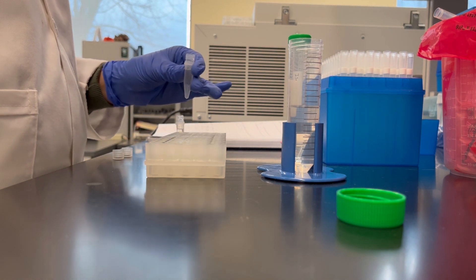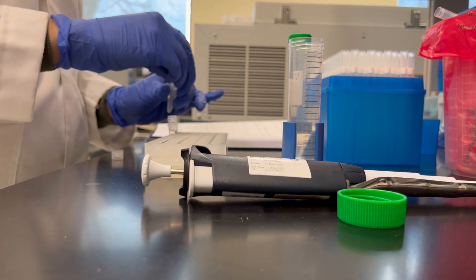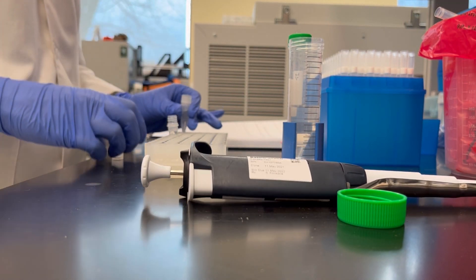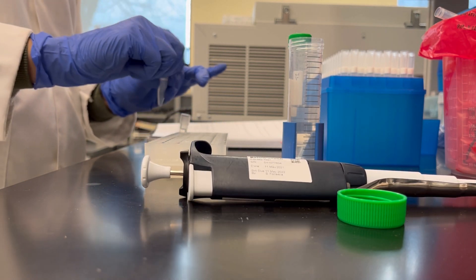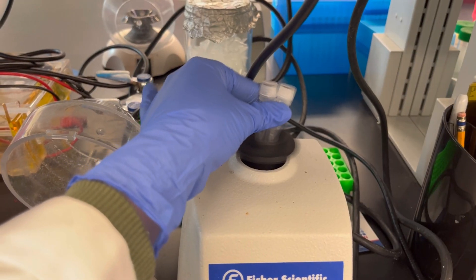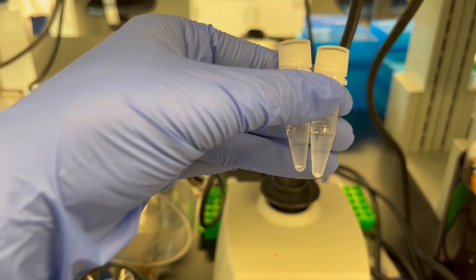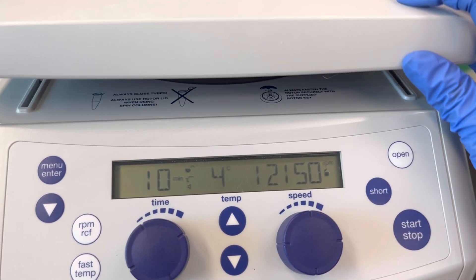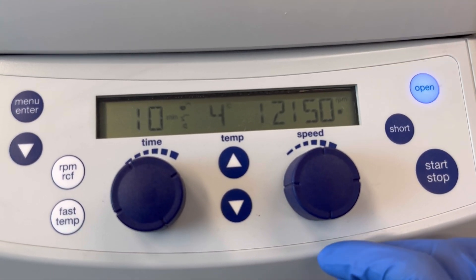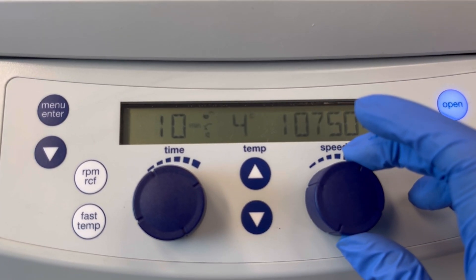For the first wash with 75% ethanol, add 1 ml of ethanol to the RNA. Then vortex it for a little bit. Then centrifuge at a speed of 10,000 rpm for 10 minutes.